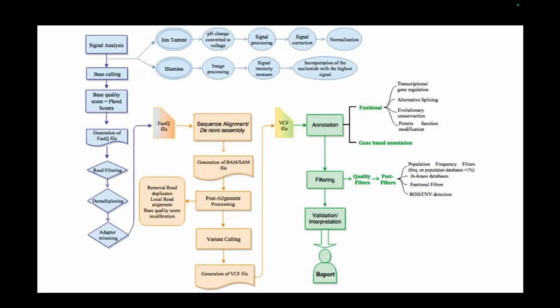You try to align with them, and post alignment you use software that can identify the gaps where the alignment is not proper. Is that a variant? Is it a single nucleotide variant, or a big variant, a structural variant above 50 base pairs or something? After the alignment is done, you use variant calling software. There are different kinds of these softwares. We'll talk about it when we reach there in the next weeks.